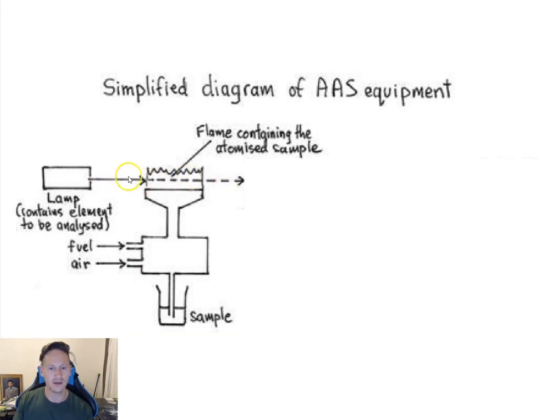And basically the light is going through that flame. So it's a vaporized sample. And the reason for that is just to get a better spread of those atoms.